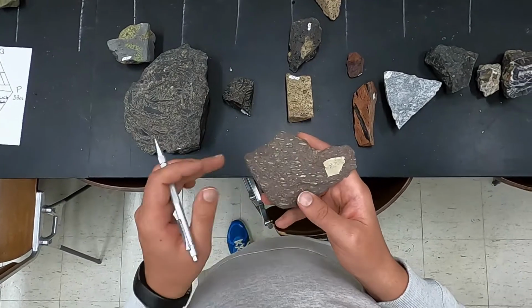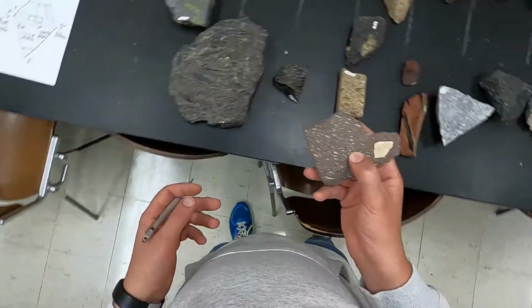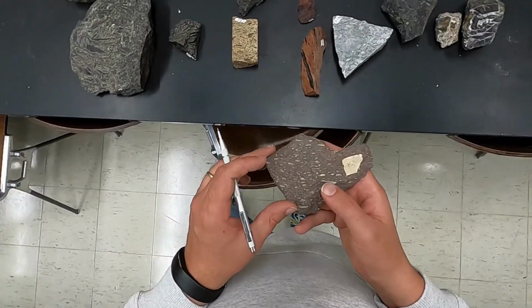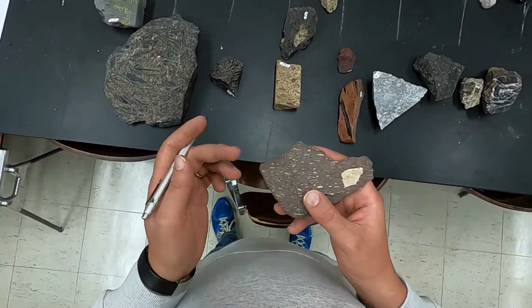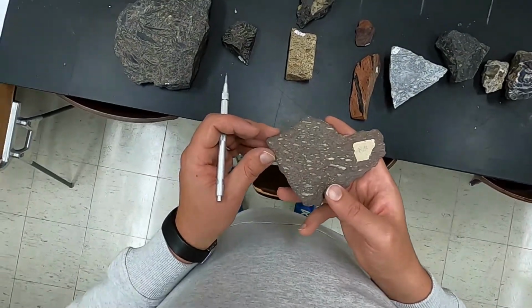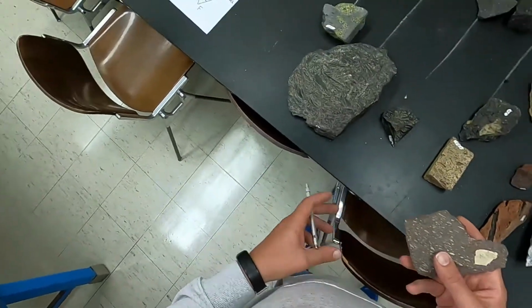We would have to establish the composition of the cement. As I stated earlier, it could be either carbonates, clays, like zeolites, or quartz. So silica can infill these. So in this case, we could test it with the acid.